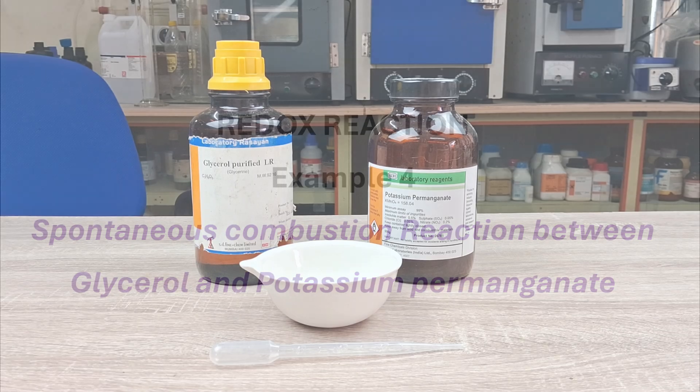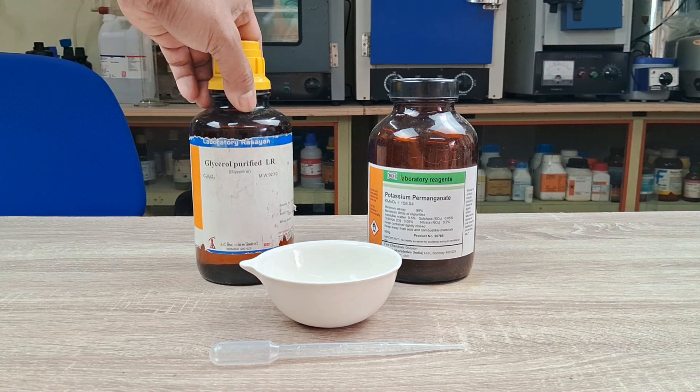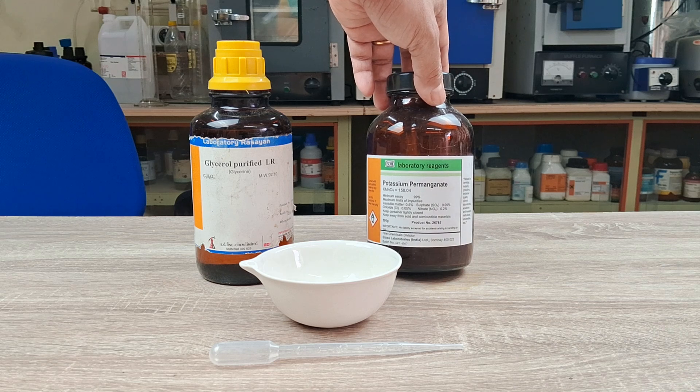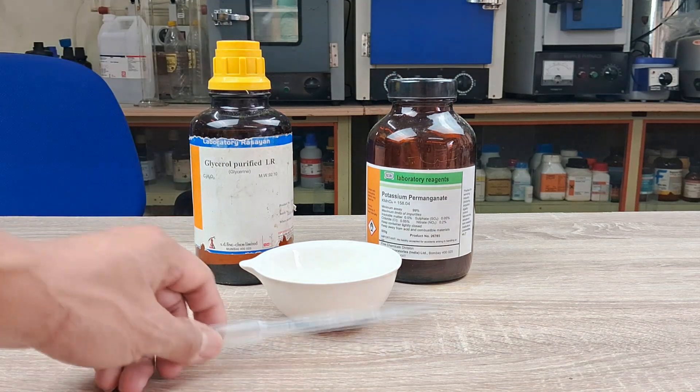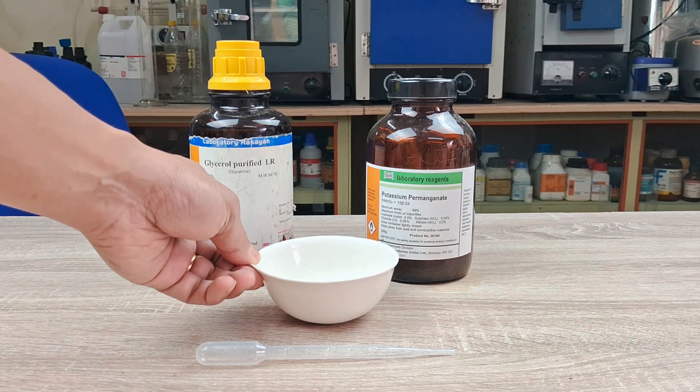To perform this experiment, you will need the following: glycerol or glycerin, potassium permanganate powder, dropper or pipette, and a piece of glazed porcelain tile or porcelain dish.